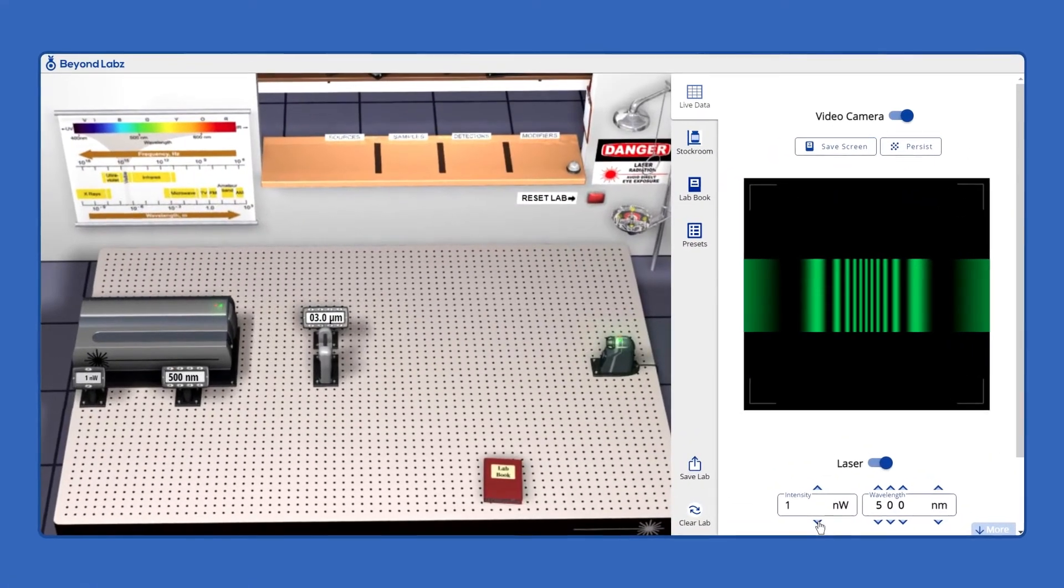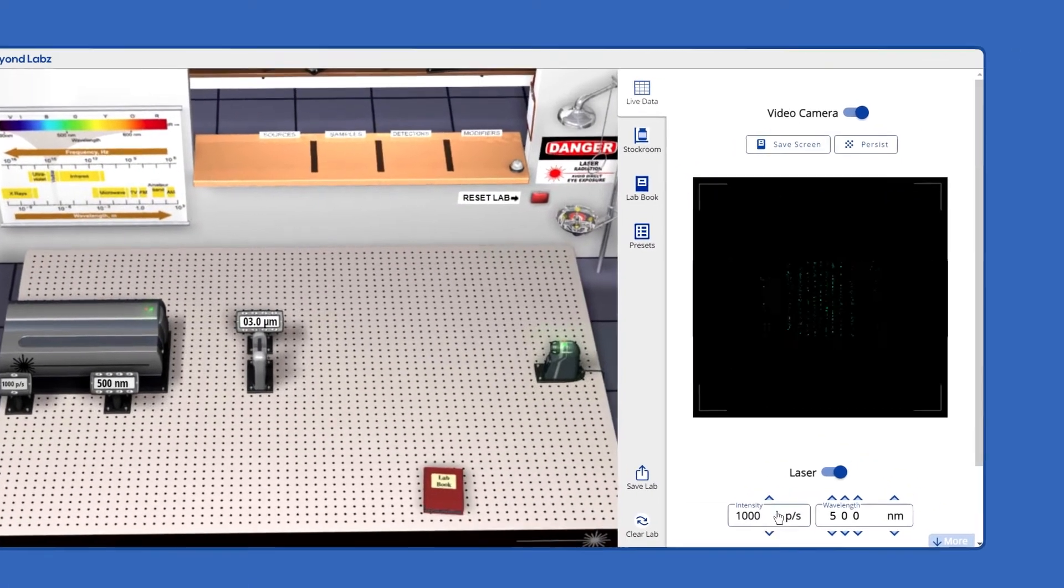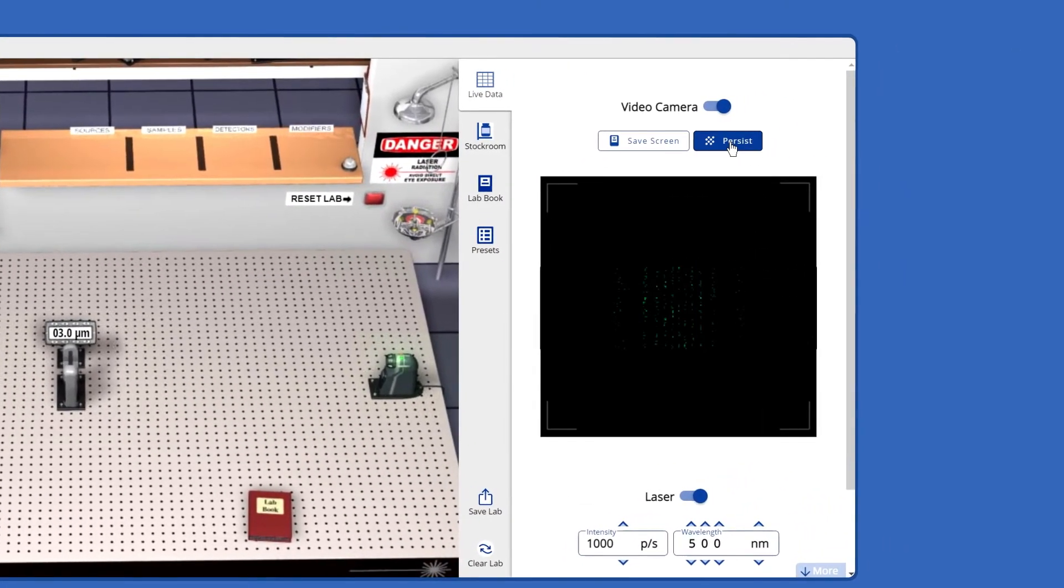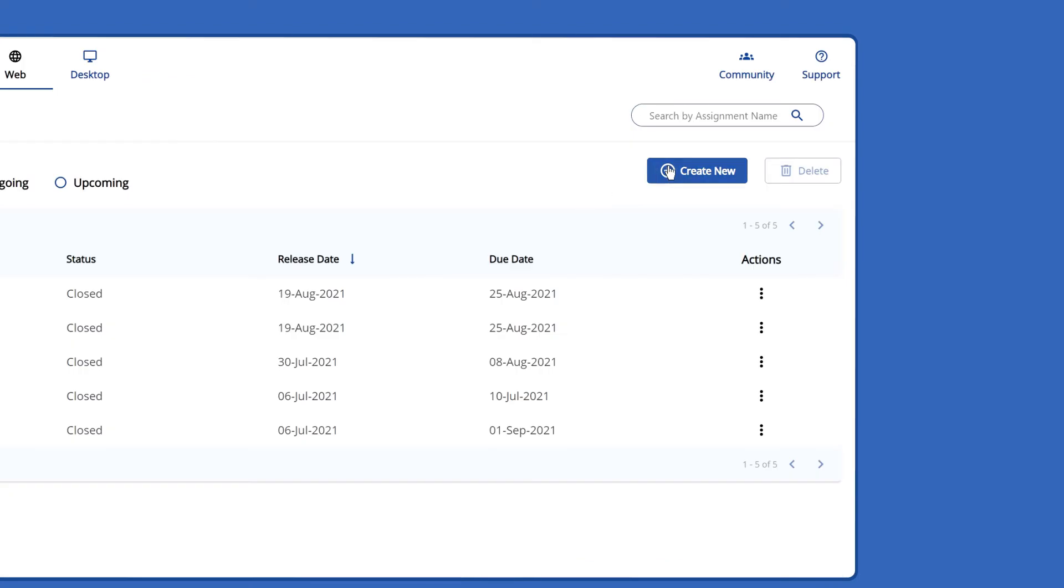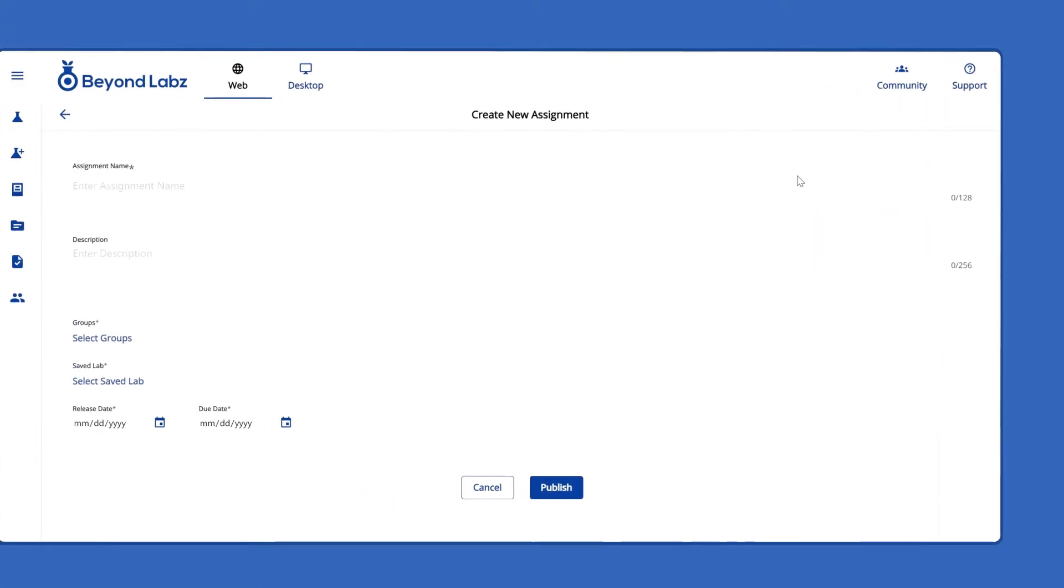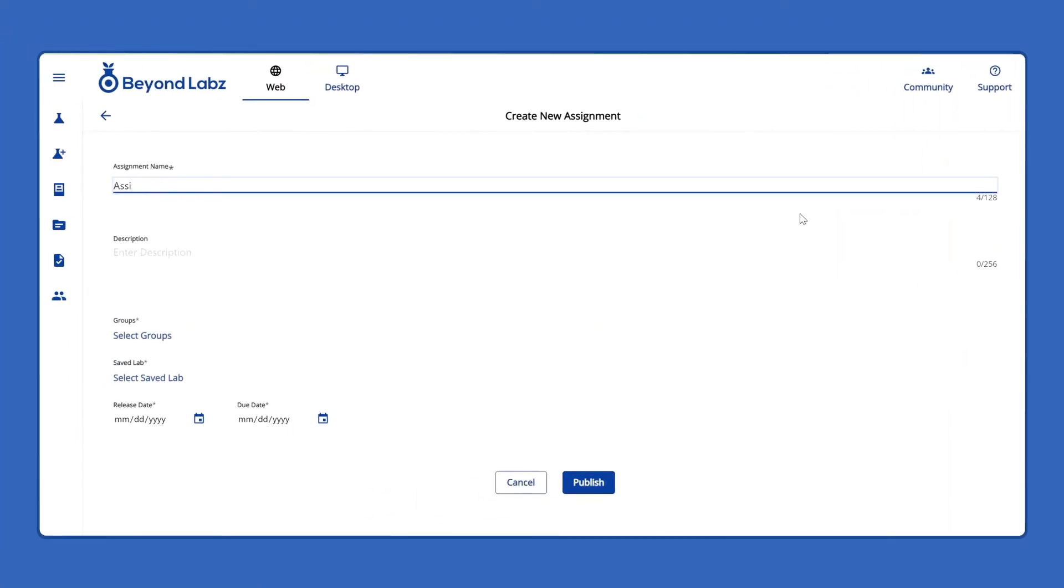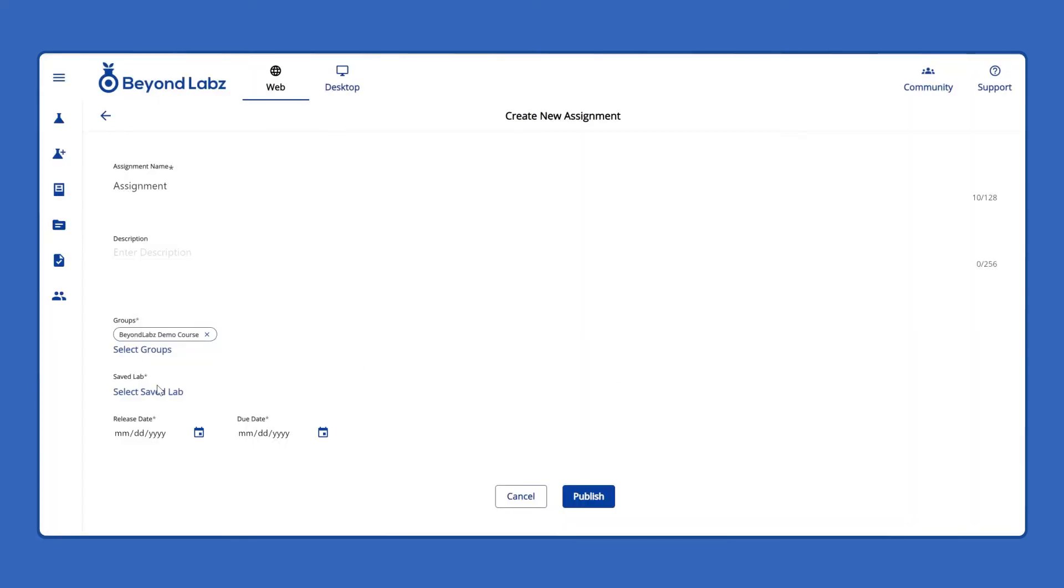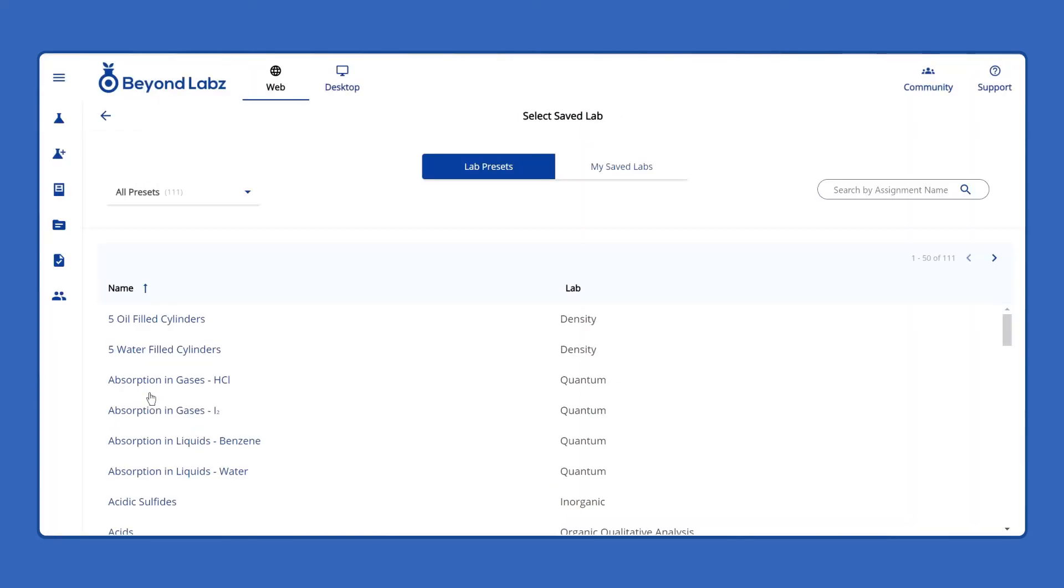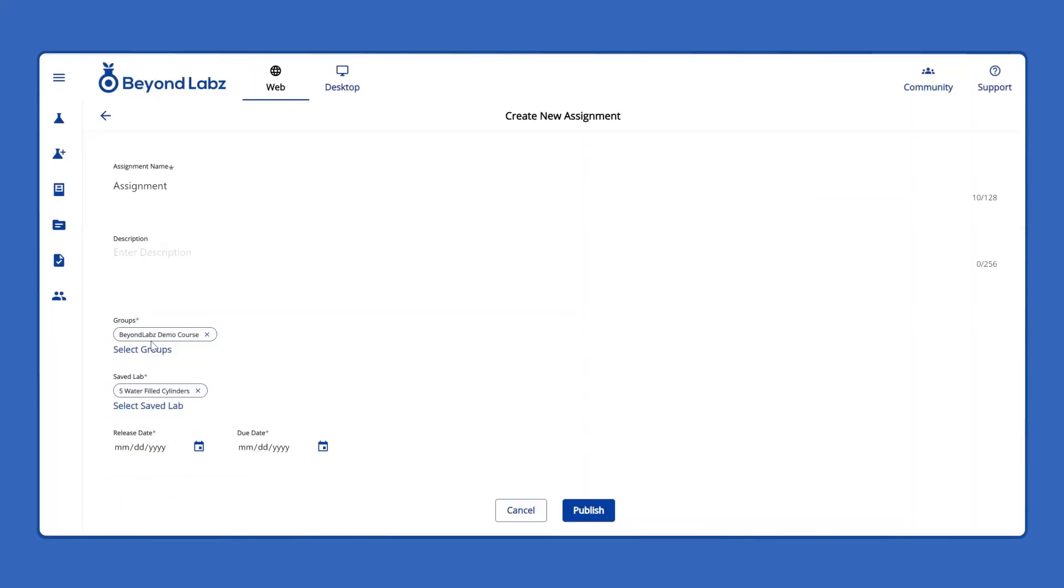Instructors can create their own experiments and include them in the assignments. They can do so by creating the assignment name, assigning it to specific student groups, and selecting their own lab preset in My Saved Labs section.